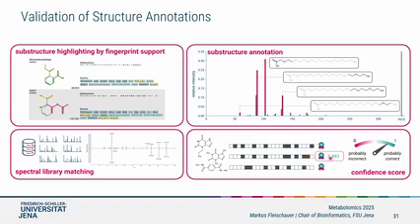So this is what to look at if you want to know whether this is a good or a bad annotation. You can even sort by that, filter by that, and focus on the things where you have good, high quality annotations. We have two different kinds of confidence scores, just to make it a bit more confusing. No, it's because they have different use cases.